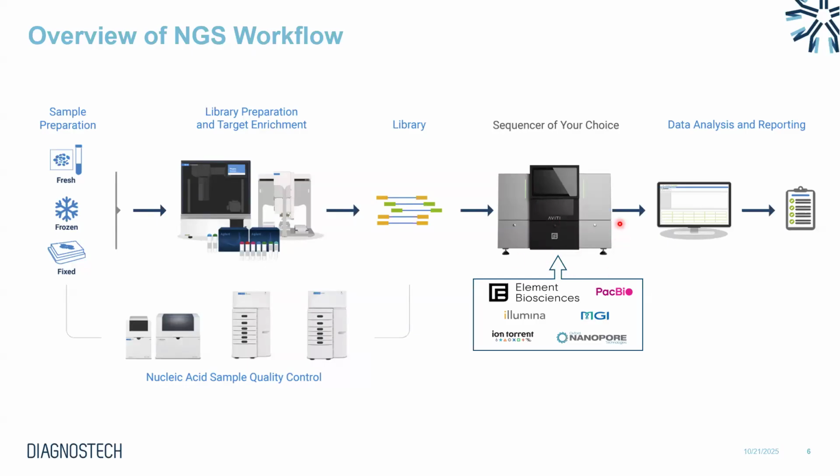And then once you've sequenced your library, you'll end up needing to perform data analysis and reporting. A very important step during an NGS workflow is your quality control, which we will be going through in a bit more detail just now.